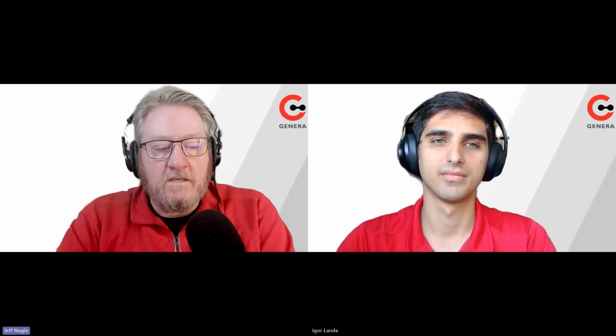Welcome, everyone. Part 2, Genera, Zero to Hero. Today is pretty interesting because we're going to move you down the line of how you can get a workspace put together. Because on part 1, we did an install of the software, and we also installed some packages for instruments. And Igor has a list of those instruments, and we're going to use those to build out Genera even further. So, Igor, give us a little hint of what we're going to do and then just take it away.